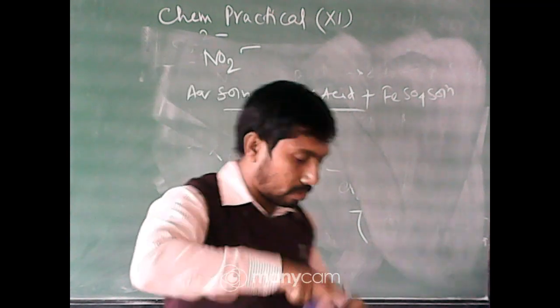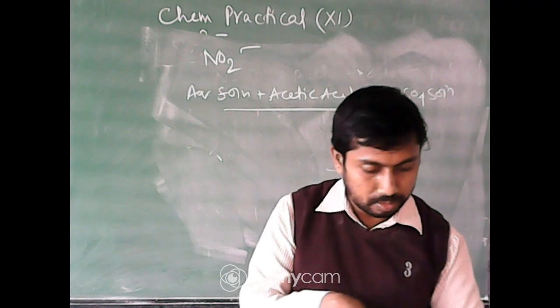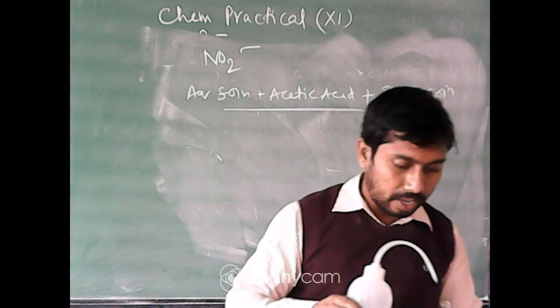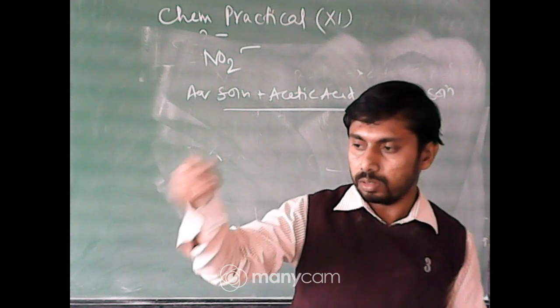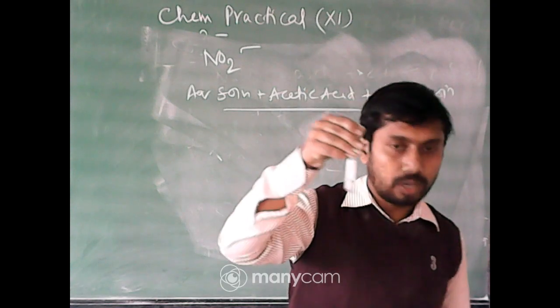For this I will take some nitrite sample in a test tube, making the aqueous solution of it. The aqueous solution is also transparent, totally soluble.